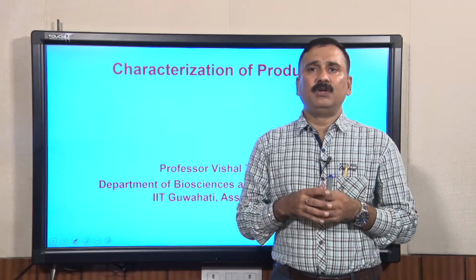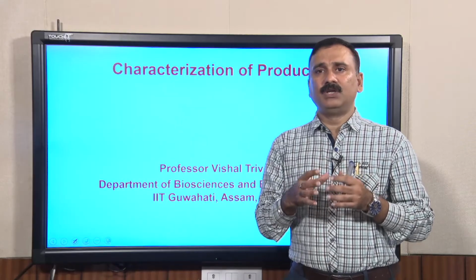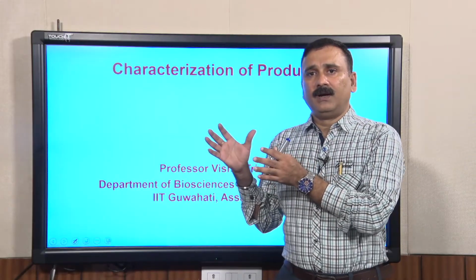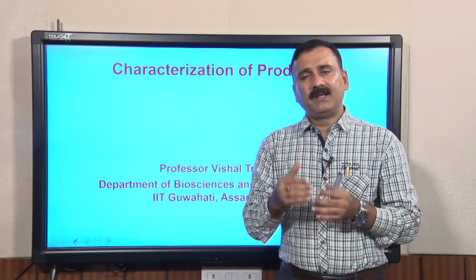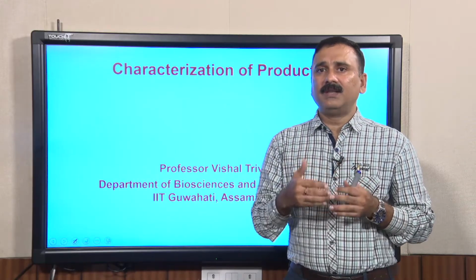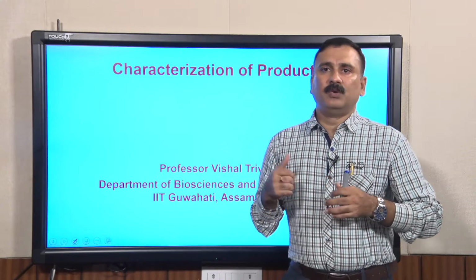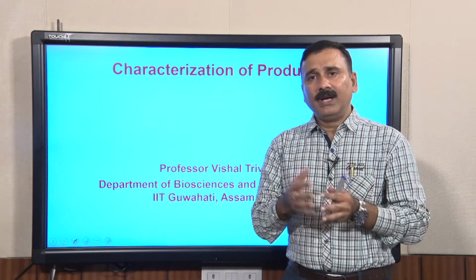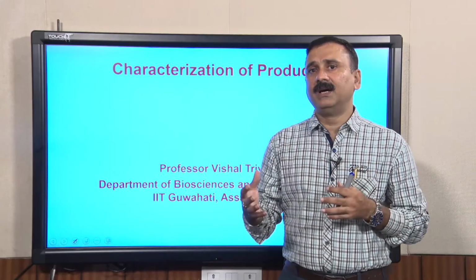Continuing our discussion about UV visible spectroscopy, in today's lecture we are initially going to discuss how UV spectroscopy can be used to know whether there are structural changes happening in the molecule or not, and subsequently we are also going to discuss IR spectroscopy to characterize the functional groups present on the molecule. So, let us start with UV visible spectroscopy and how the absorption spectra is modulated when you have different types of changes in the molecule.